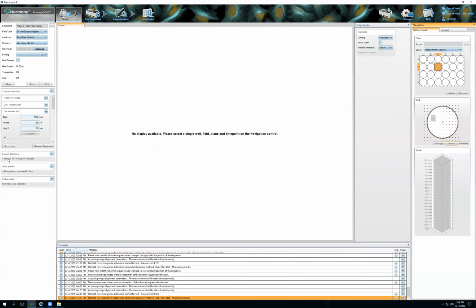planes, you see how this will go up significantly more. So you can get an estimate of how long it's going to take versus if I have this at 1,000. So this changes it by 5 minutes.